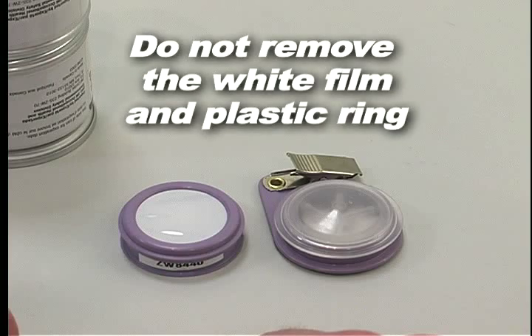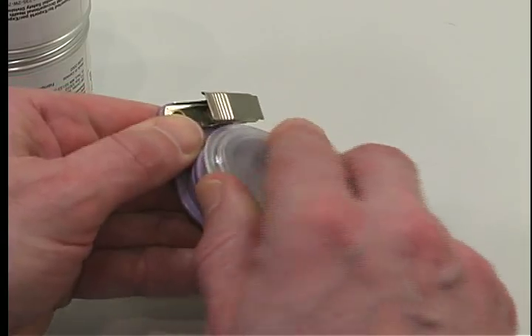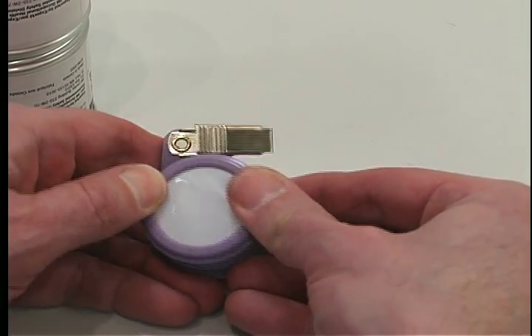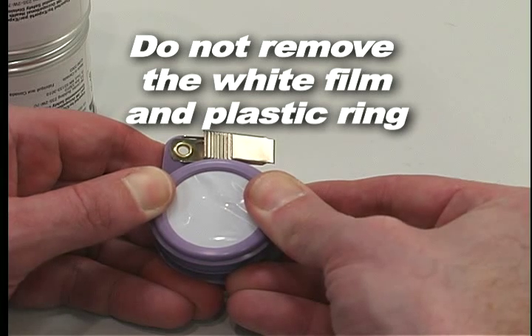Do not remove the white film and plastic ring. Remove the moisture retaining opaque cap from the bottom section of the monitor and discard it. Proceed immediately to the next step. Snap the top and bottom sections of the monitor together. Do not remove the white film and plastic ring.